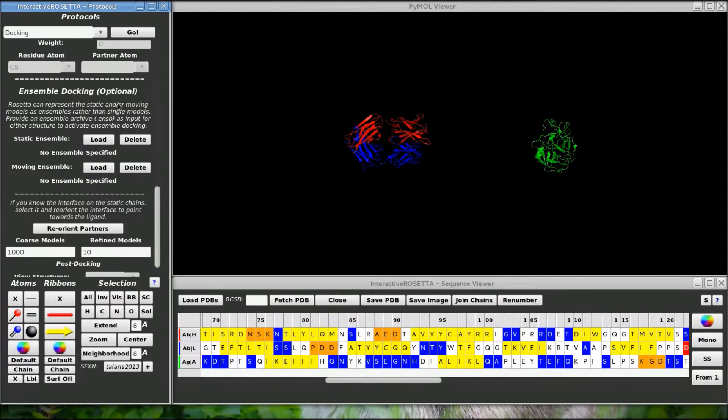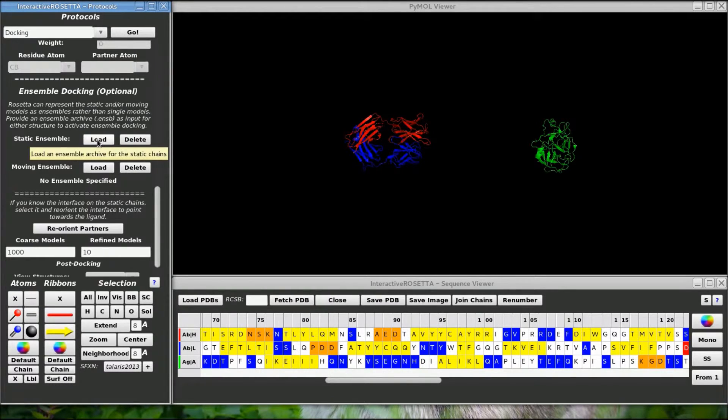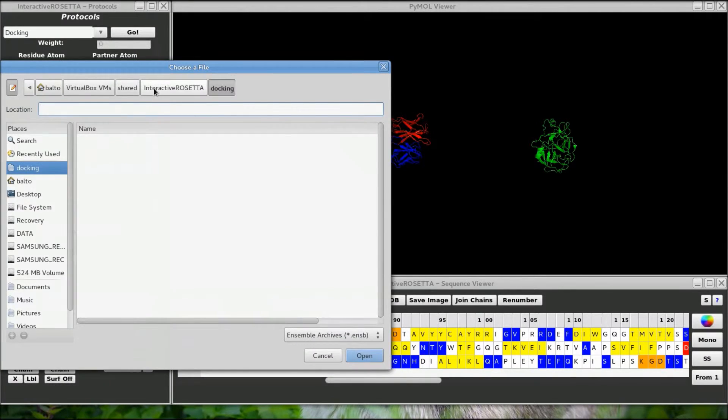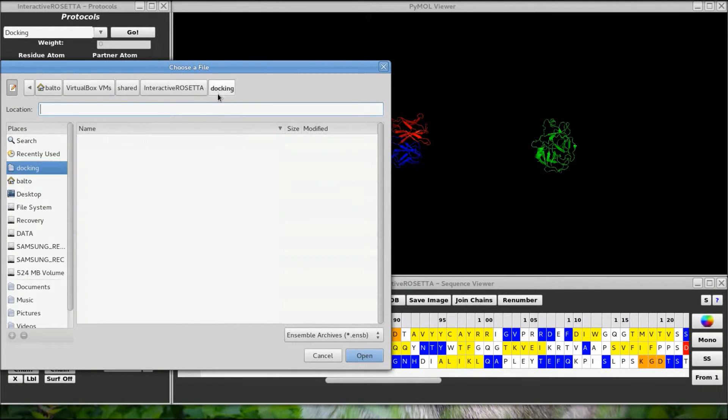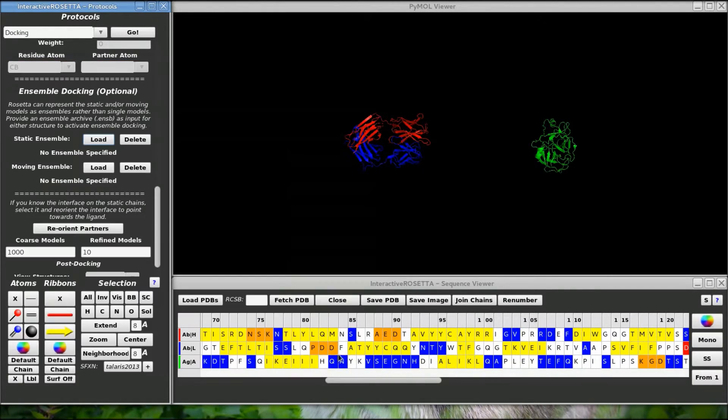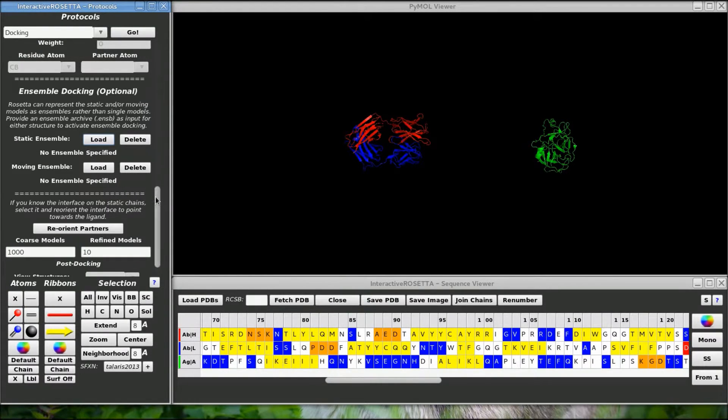Turns out that you can model backbone flexibility during docking by docking ensembles together instead of single structures. So if you want to do this, you will need ensemble representations of the static and moving groups. I will explain how to generate those in the ensemble generation tutorial which is another protocol. We are almost ready to perform docking.